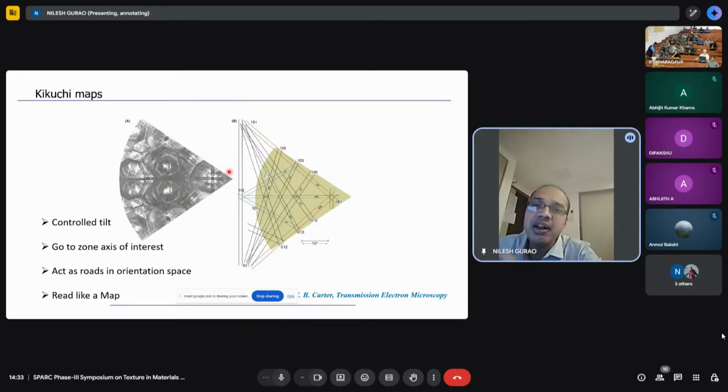Nowadays, a lot of people are working on different kinds of alloys like high entropy alloys or different newly developed alloys. So you can't simply put copper, aluminum, titanium. You can't do it like that. Why? Because you should have done the homework first. Homework first means you should have done the X-ray diffraction first, so that you know the information. You should know information about the chemistry. You should know the crystal structure. You should roughly know the lattice parameter. All this information has to be fed into EBSD so that these bands can be correctly indexed.